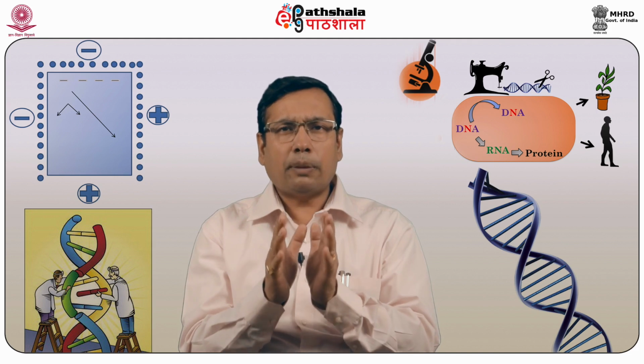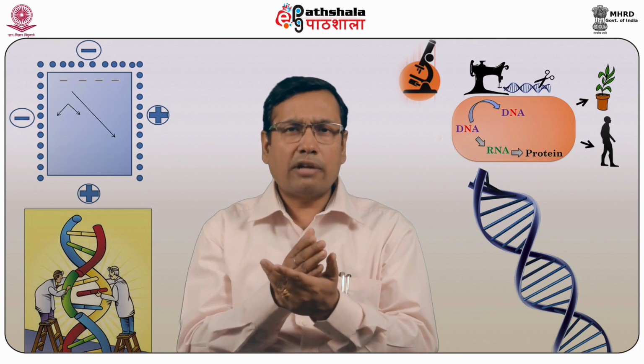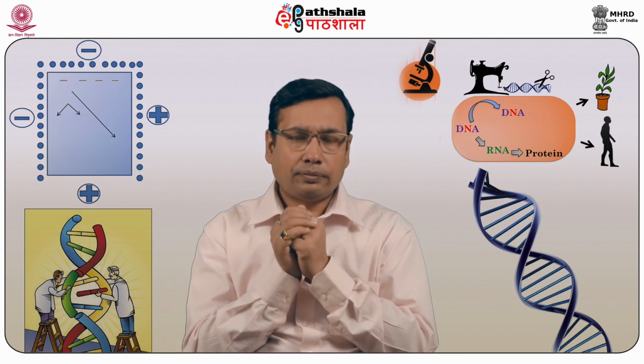So this was the concept of hot start PCR: upon completion of the first reaction, add the Taq polymerase and complete the reaction.